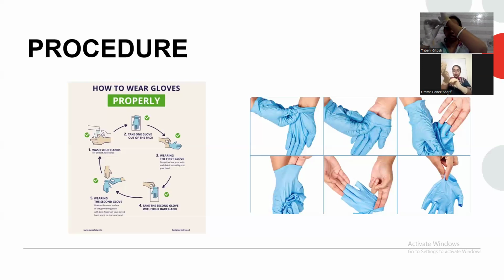Okay. So first I'm going to push my fingers inside like this, and grab it from the upper side, grab it without touching any part of my skin, and all the upper part of the gloves is inside. Yes, it is. Then with this hand, can you see? Oh, I already took off my gloves. It's okay. If you take off your gloves, then now your hand is not contaminated. You can touch your skin now, just like this.